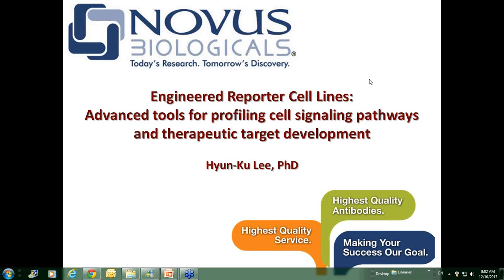Thank you, Cody, and I would also like to thank everyone for attending this webinar today. I'm going to go over our reporter cell lines, including mechanisms, usages, and applications. And later, I'm going to introduce the cell-based drug discovery screening services we provide.